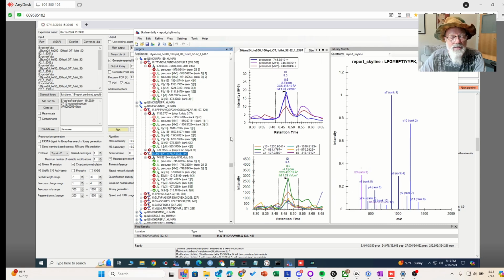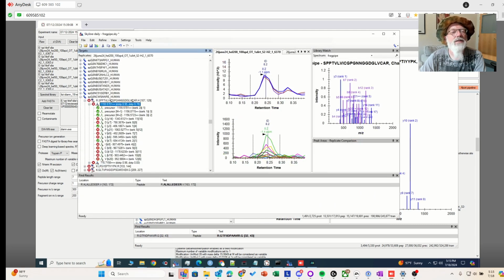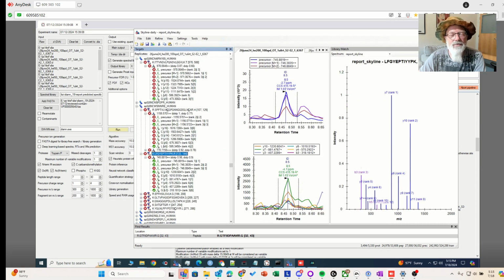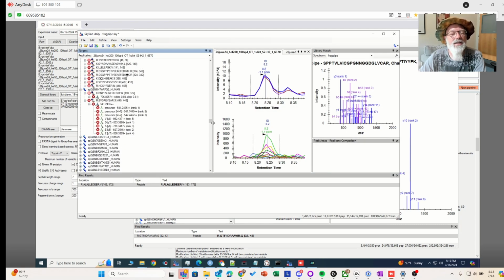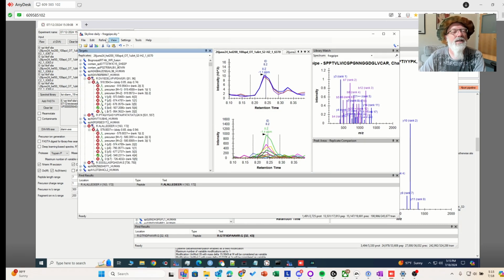Okay, so let's see, FragPipe. I have the FragPipe results from my other video, which I'll put in the comments. And let's see how this one looks. So this one is from DIA-NN. Let's see if Skyline, FragPipe Skyline, sees the same thing.